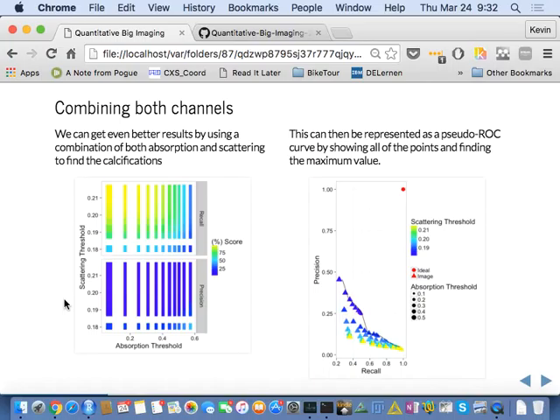What was the ground truth for your images in this case? Was it that you actually label images? Yeah, the ground truth is usually manually labeled. It is very time consuming and intensive to create all of this. If you look at how people work without techniques like this, they simply have their algorithm and they tweak parameters until they think it looks good, and then they go. This isn't a very robust method, and it won't let the computer tweak parameters for you because you don't have any clear goal. You just say, this is when I feel happy about my image, and then you move on.